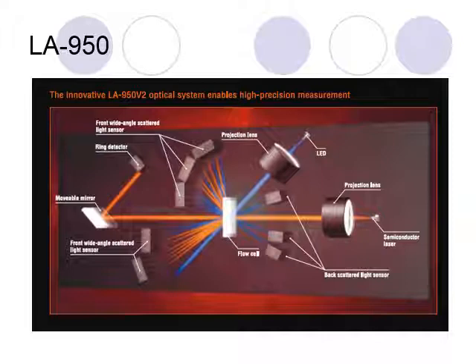Then you have a laser. You shine it through that, and where the light diffracts to sensors that are arrayed around that cell will allow it to measure the size. There's a direct beam through that they use for determining the alignment and measuring the intensity of the laser. It does some system checks that way.